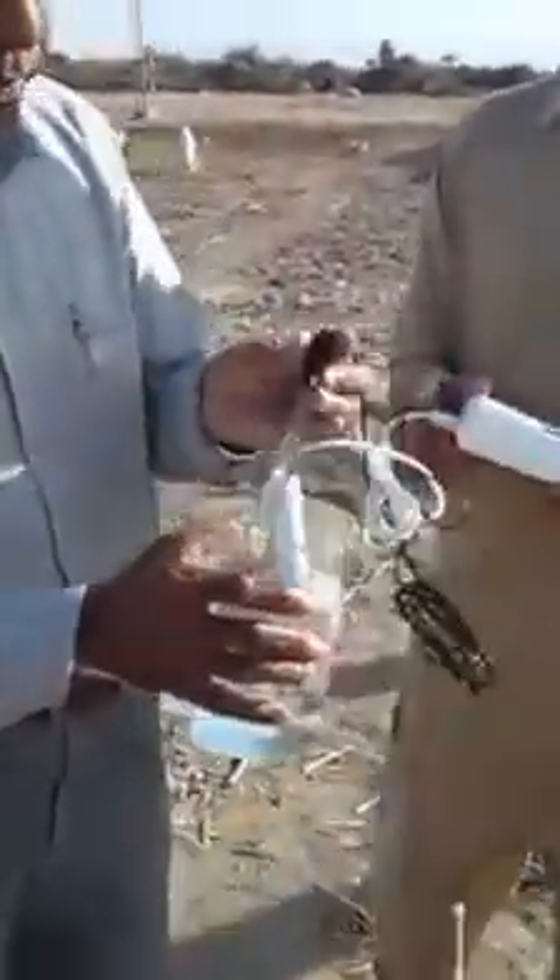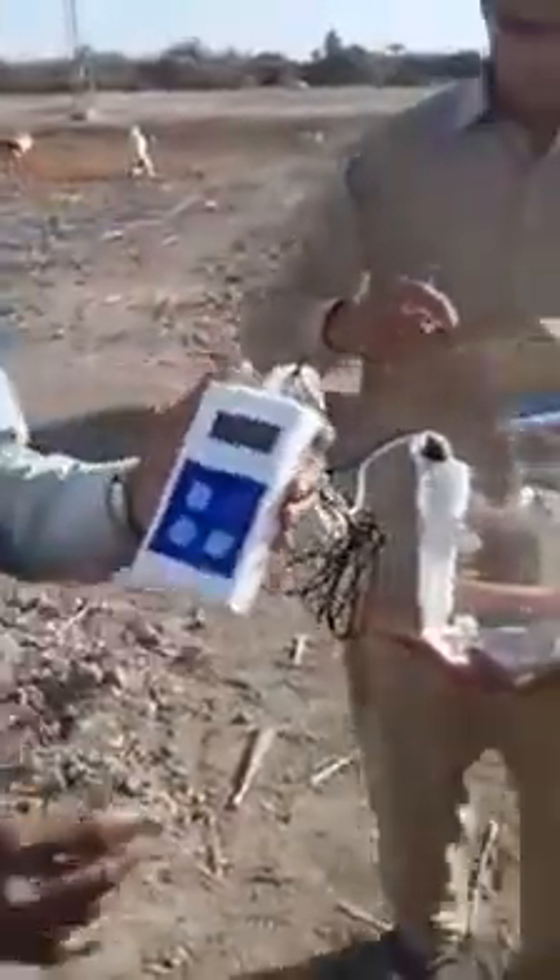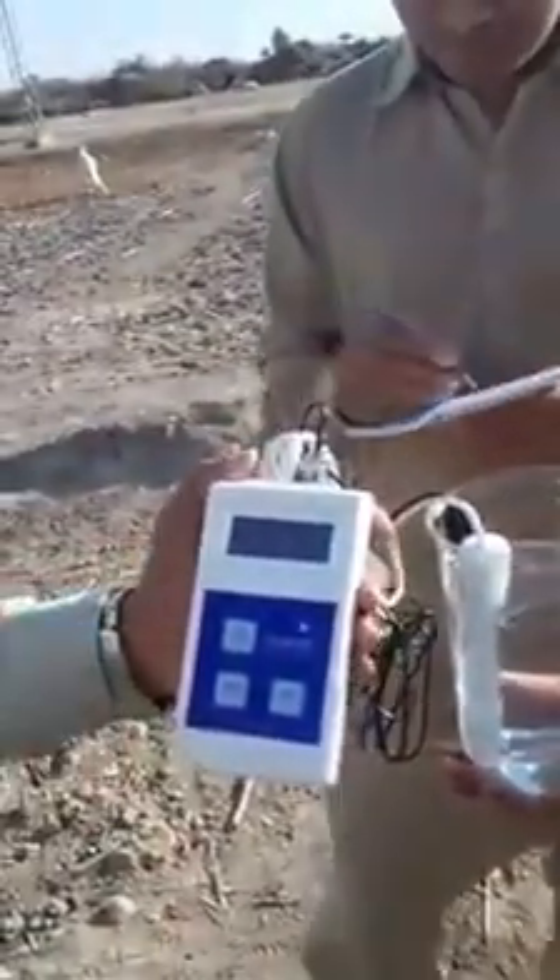I am now inserting the TDS probe and pH probe into the water sample. As you can see, the reading shows 7.4 pH. This is within the safe limit, as WHO specifies a safe range of 6.5 to 8.5 — so this value is quite safe.